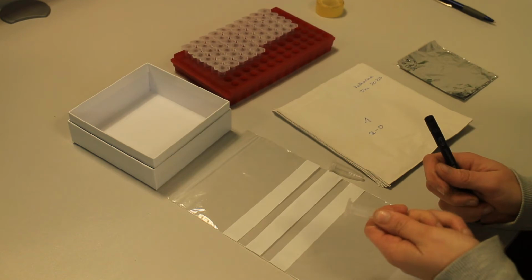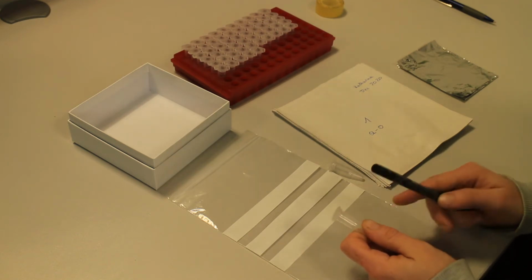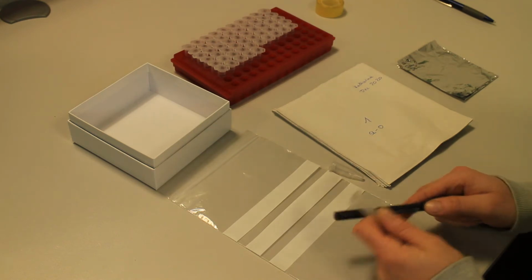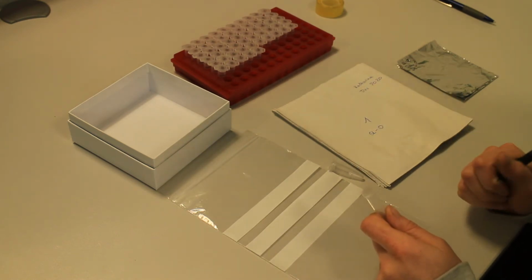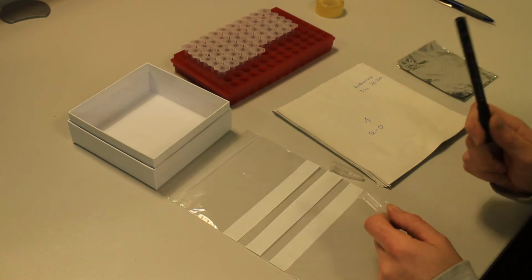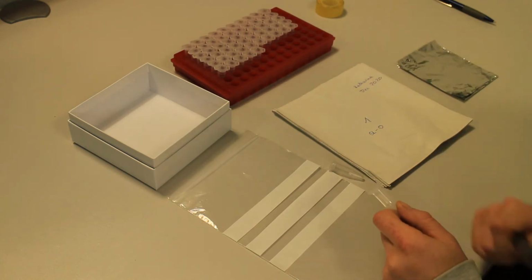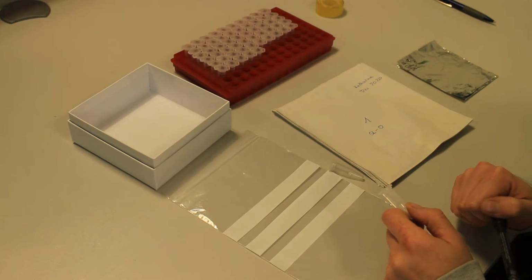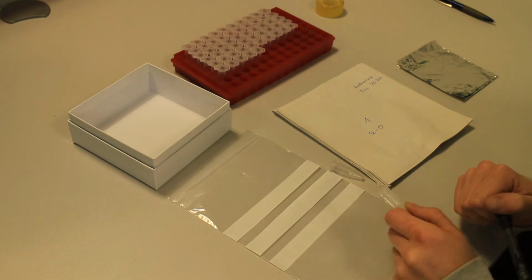Because if there are some of these vials kicking around in the freezer that don't have an experiment on them, they're going to be thrown out, because nobody knows anymore what sample 24 was supposed to be. Like, which experiment is that? So that's lost. So if you do not label your samples properly, you might as well not bother taking them in the first place, because chances that they will be thrown out or they will be lost are so high, it's just not worth it. So put the time in, label them properly so that you can find them and other people can identify them later on as well.